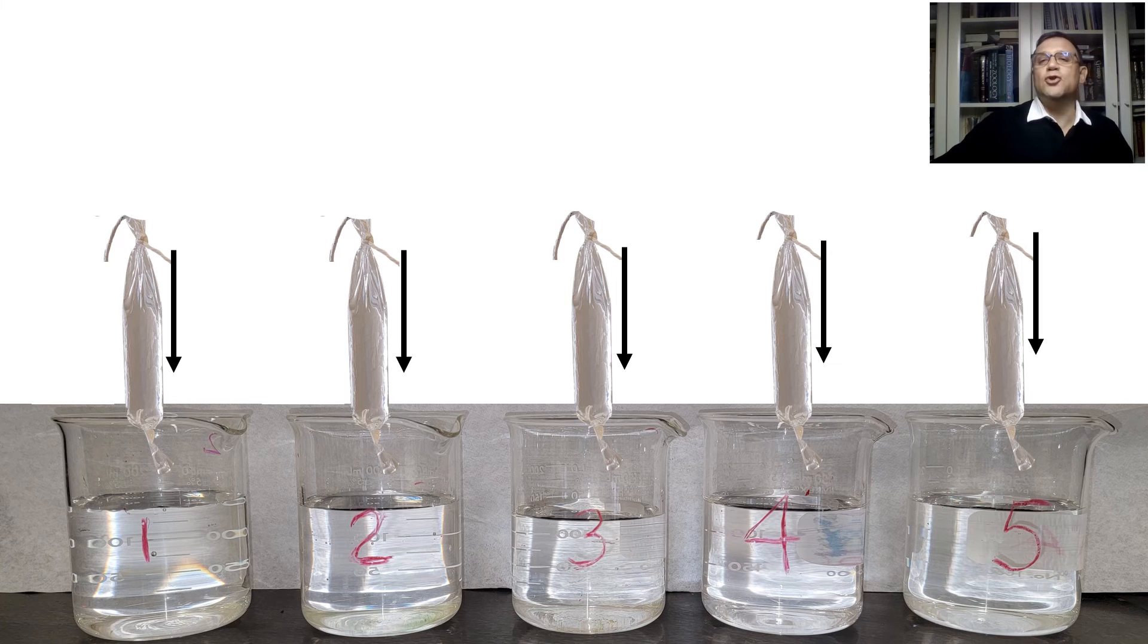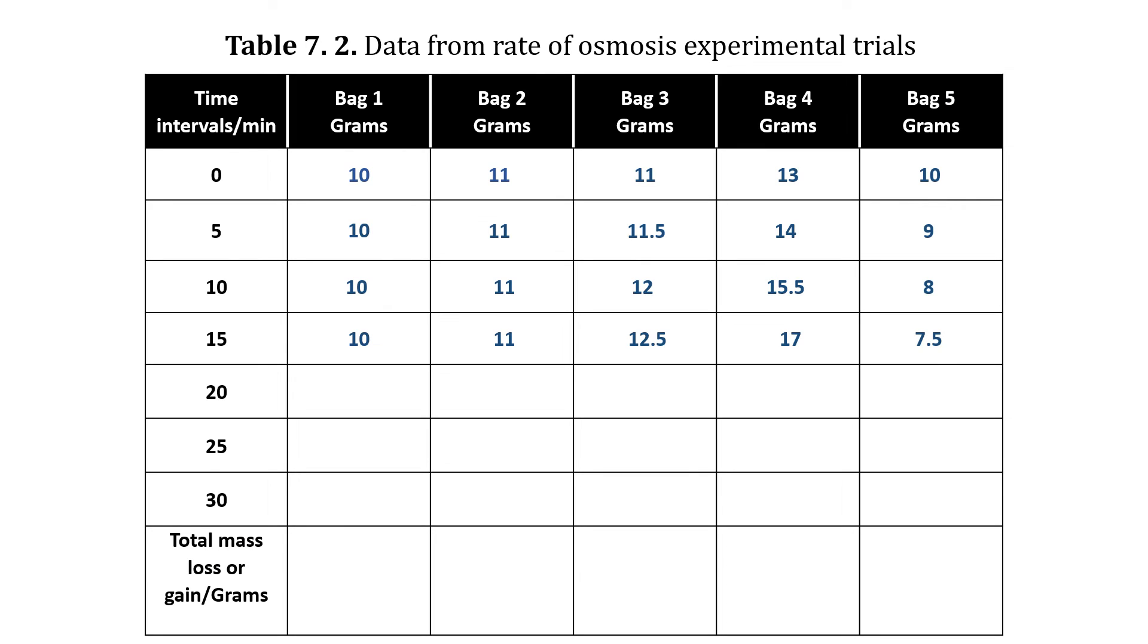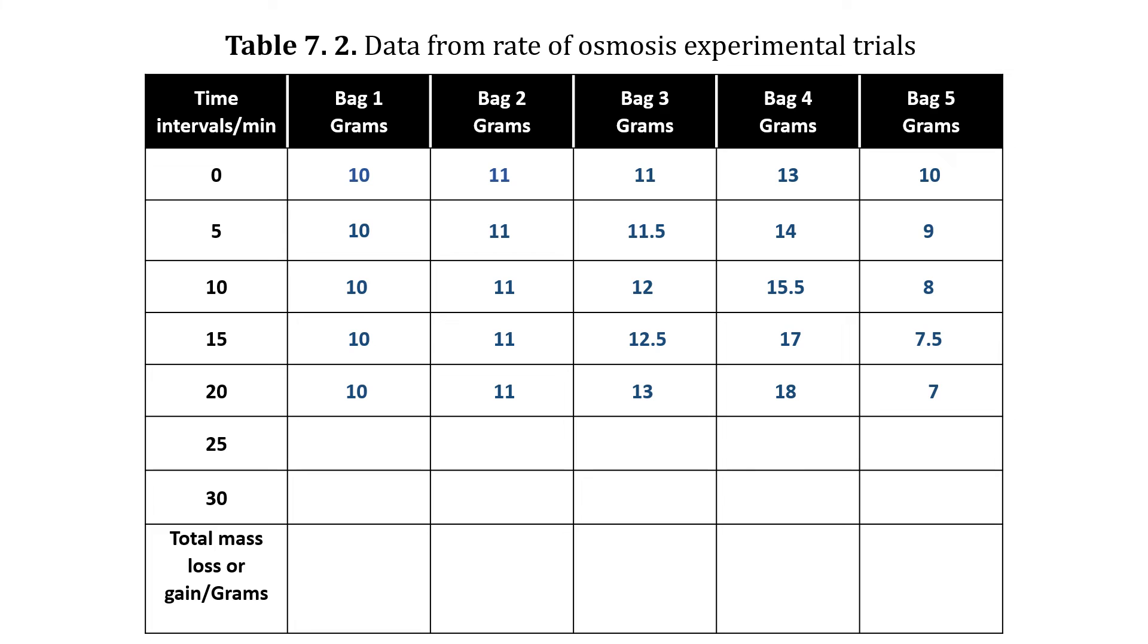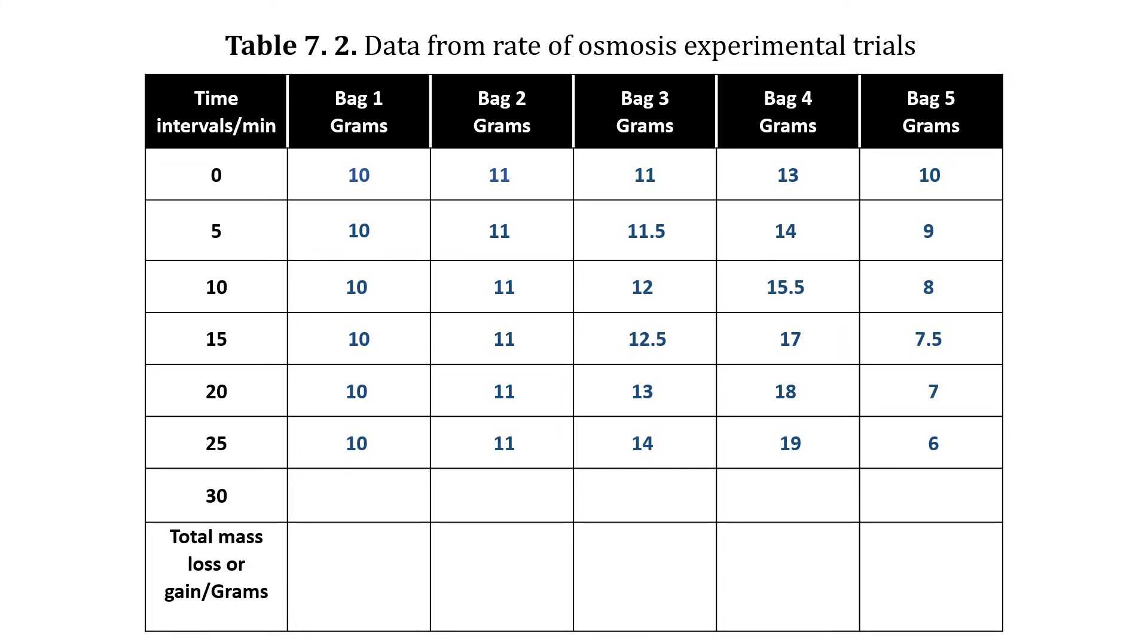Once again, submerge all the bags simultaneously into their respective beakers and leave them there for another five minutes. Afterwards, remove the bags simultaneously and record the new set of data. Here we go for bags one, two, three, four, and five. Now we will repeat each step once more. And again. And again.